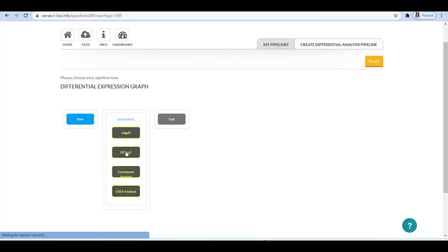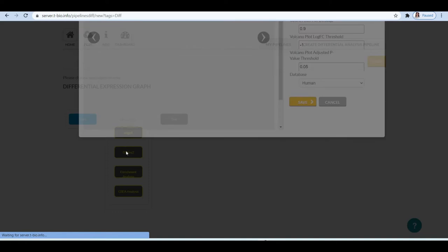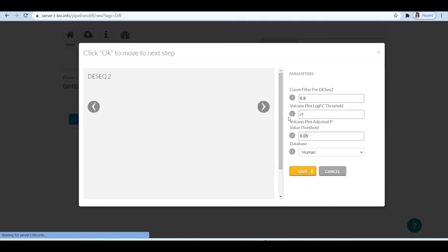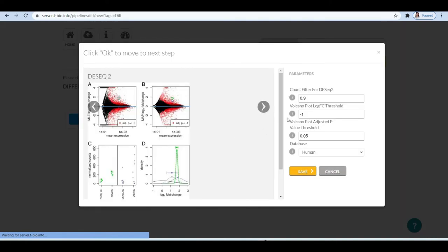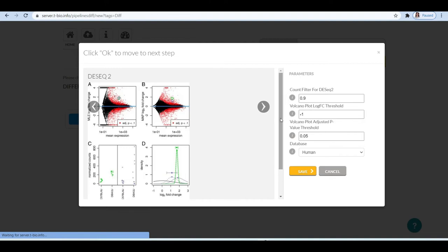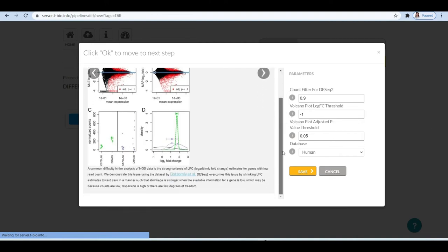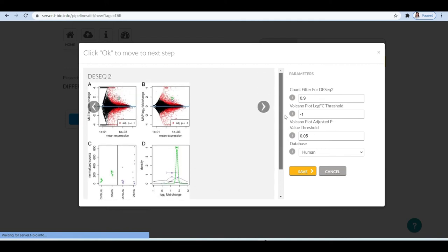Next, to perform differential gene expression, click on the DESeq2 module or you can also choose the edgeR. Here, we are using the DESeq2 module, so while clicking on DESeq2, you will get a pop-up to define or specify the parameters. For Volcano log fc, the value should be minus 1. It is better if you choose minus 1.5. And the value for p-adjusted for significant genes should be 0.05.